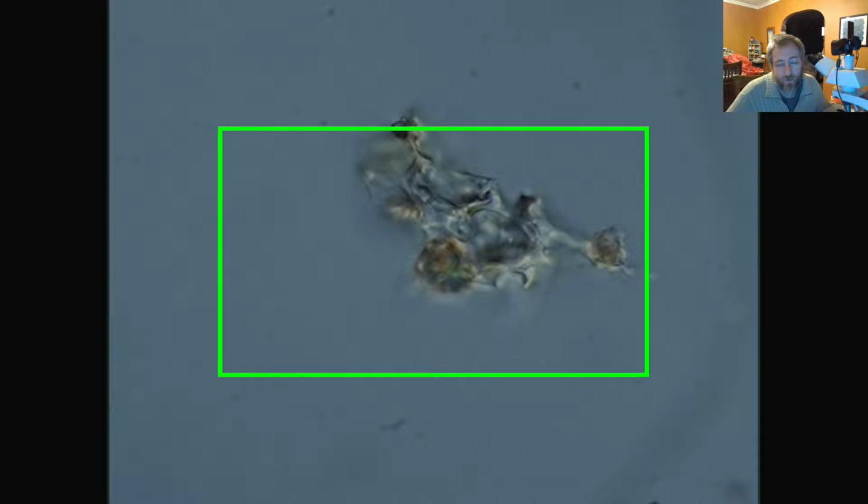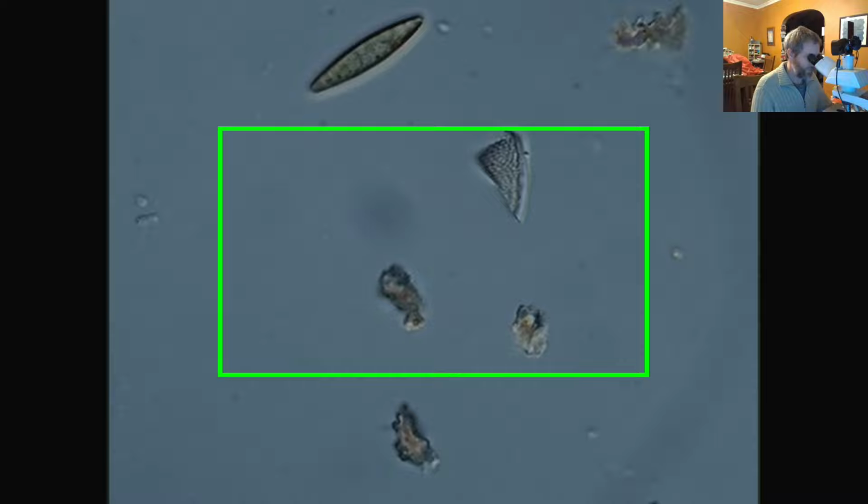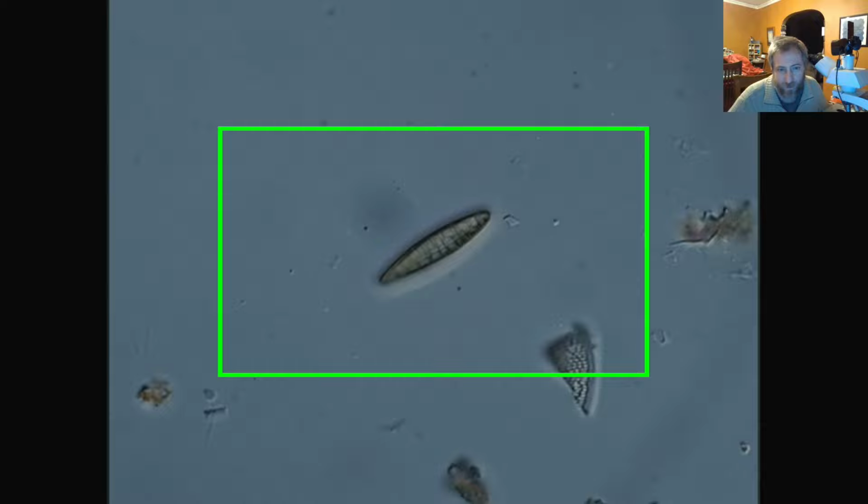The samples, I thought they'd been processed, but they actually haven't been processed at all. And so there's still a bunch of the organic material present in them, which is kind of funny because we put it on the SEM and I noticed that there were a lot of colonies that were still sort of attached and that many of the diatoms were in their life position. And I saw a bunch of organic debris on the slides, and I thought, well, whoever processed this, they must not have done a very good job.